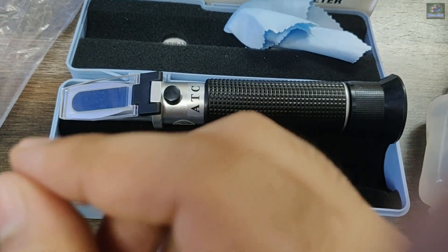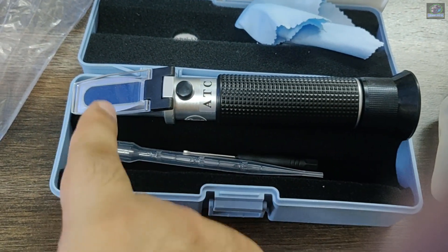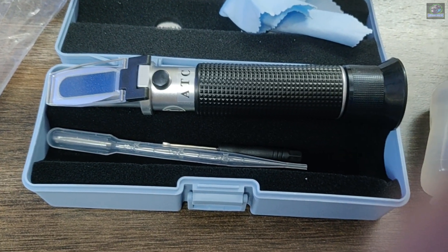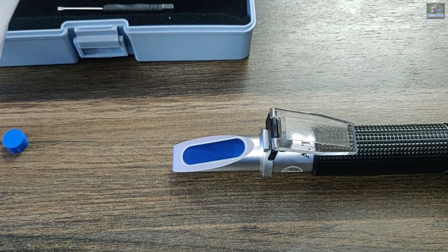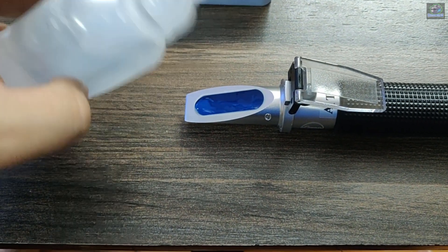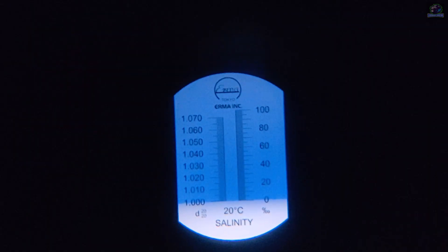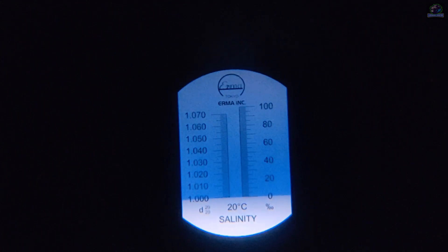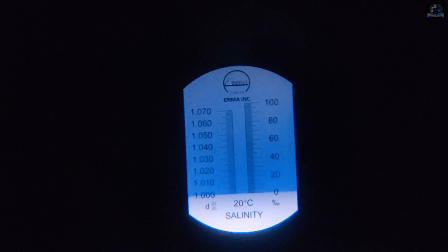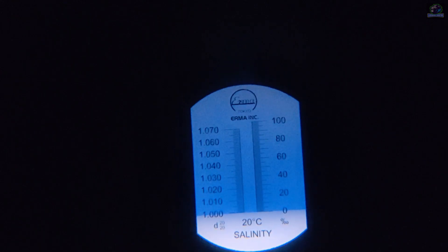After calibration, wipe off this area, then take a few drops of salt water from your tank and put it here. Make sure there are no bubbles in between, then check the reading — it should be anywhere between 1.020 to 1.025. Now let me calibrate my refractometer by adding a few drops of distilled water. After calibration, the level should be maintained at zero, as you can see.